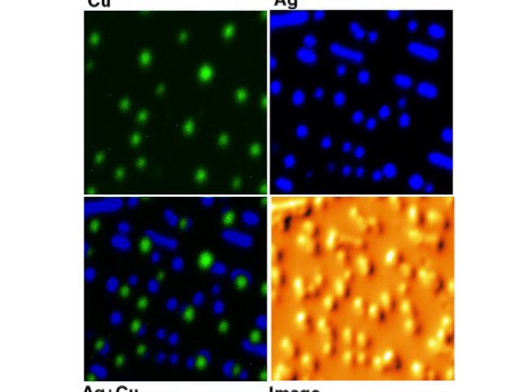Using this information, I can tell how the elements partition or spread themselves out across the material. Here's one such image that shows the elemental distribution of copper and silver in a lead-free solder alloy. And from this picture, I can tell where the copper is and where the silver is and how they combine to give the solder its special properties.